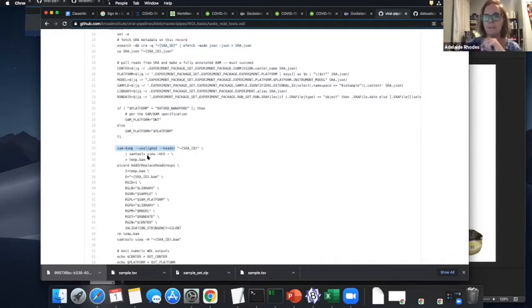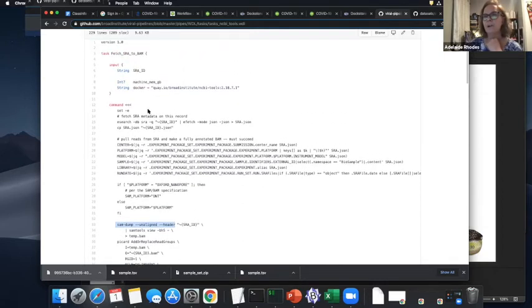This is the script that somebody wrote, this little bash script that's inside the NCBI Tools WDL, which is imported into the WDL I found in the workspace. So this was a little bit of an unusual case study because it was 2 steps of WDLs to dig down to get to the bash script that I want to change, right? So really, I would replace this with, I like how it pulls out metadata. I still want that. So the first step wouldn't be eFetch.